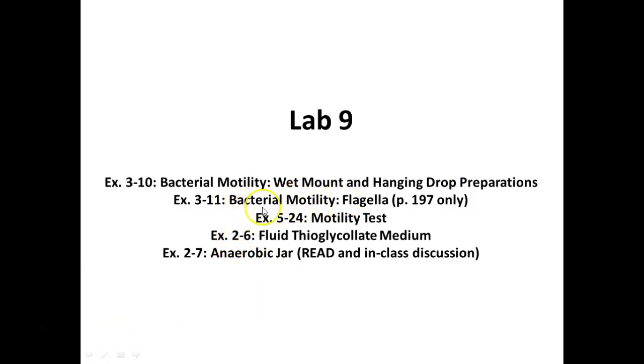And that's the only thing really in this other exercise that we have. We don't do the staining again because it's kind of difficult. I actually bought the stain and tried to do it this summer with the STEM kids, and we didn't get any good slides, and I was really bummed. But in trying to figure out the problem with our goggles, I had a drawer I was going to use, and I forgot there was a whole stash of slides in it from other labs and other people over the years. I went through that and found a bunch of microbiology slides, and a bunch that have flagella stains on them, but I haven't had a chance to look at them.